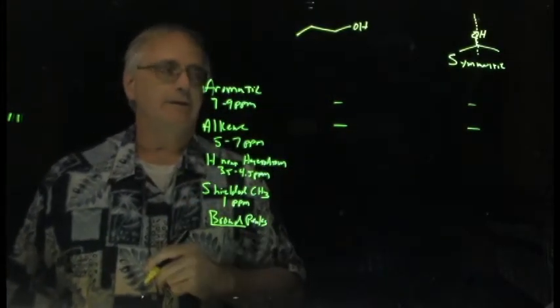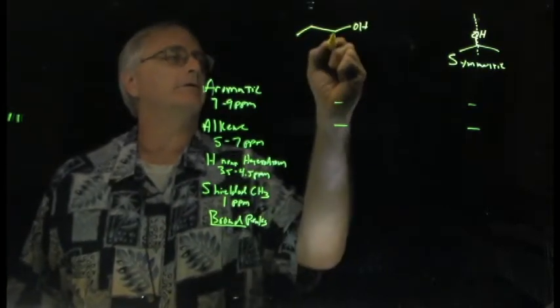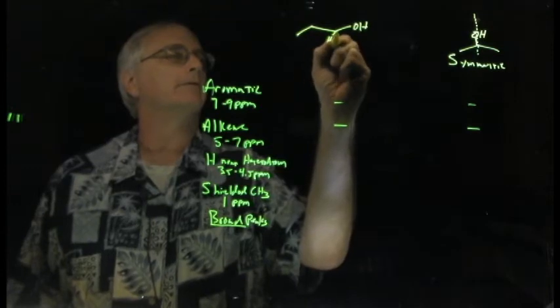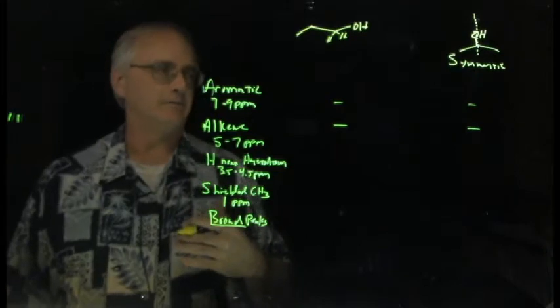But hydrogens near a heteroatom. Now, these are going to work because we have this group of hydrogens. I'm going to draw them in. Sometimes students will see it a little bit more clearly if you draw the hydrogens explicitly here.